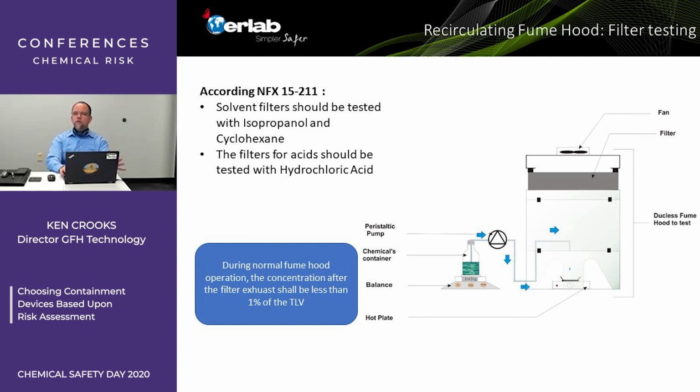TLV, threshold limit value. We spoke earlier about 4 different chemicals from chloroform to methanol, of the short term and the long term. I'm talking about the long-term exposure limit. So that very small value to begin with, now you want to be less than 1% of that, just to absolutely guarantee and maintain safety. That is the test standard of NFX 15211.